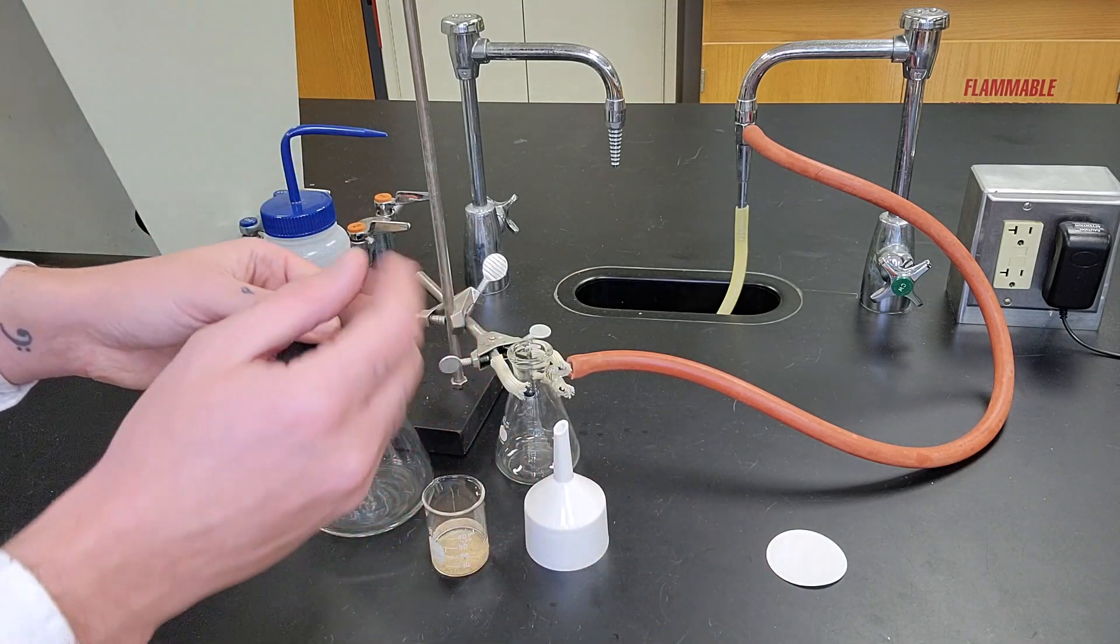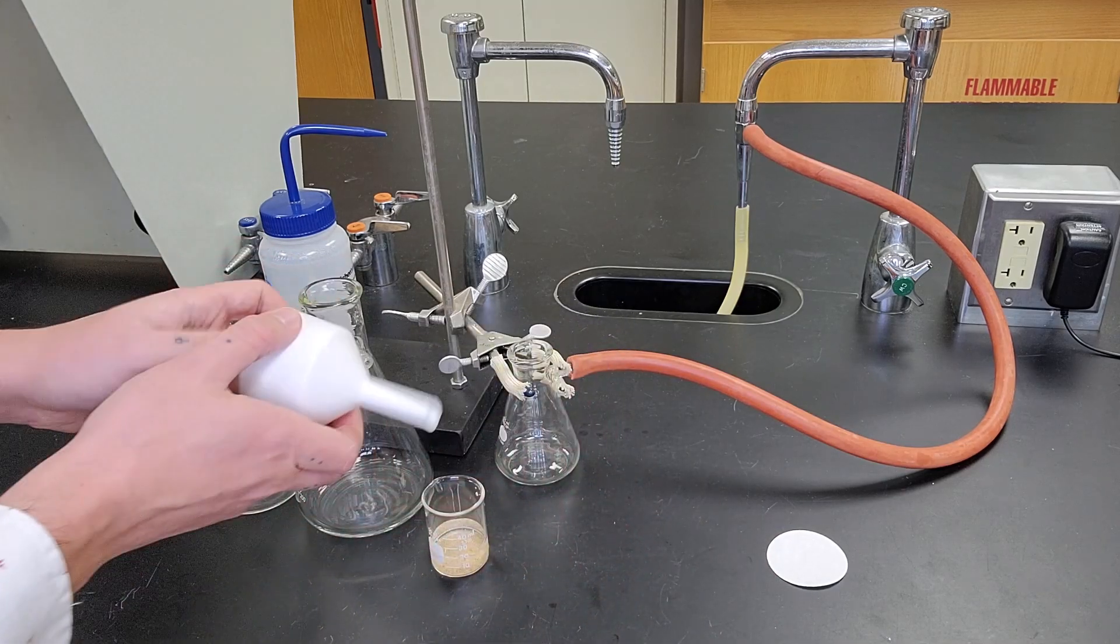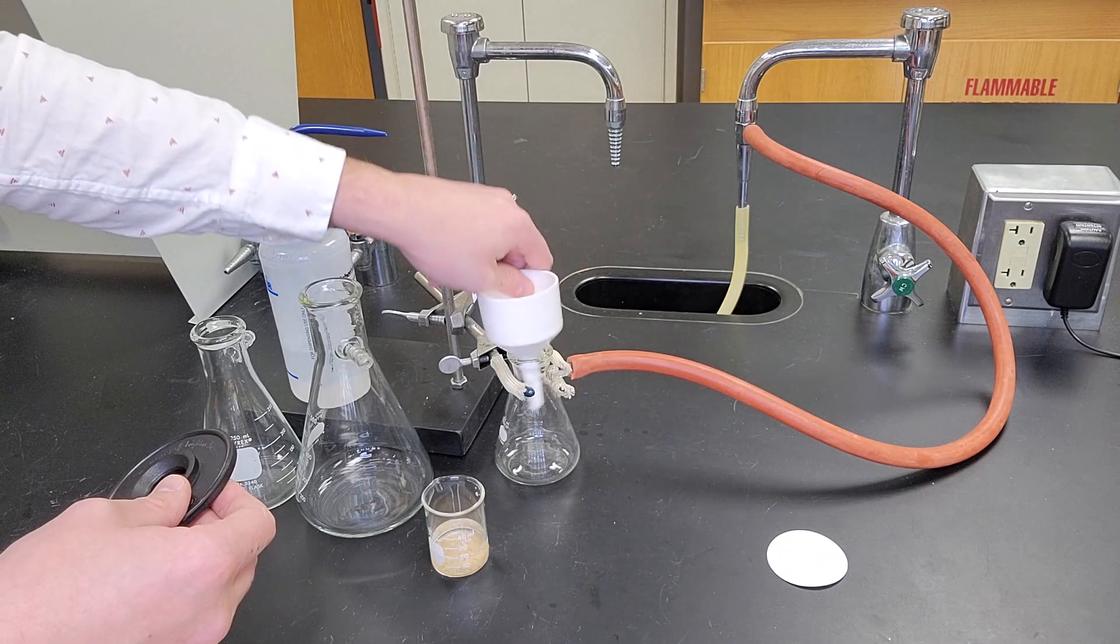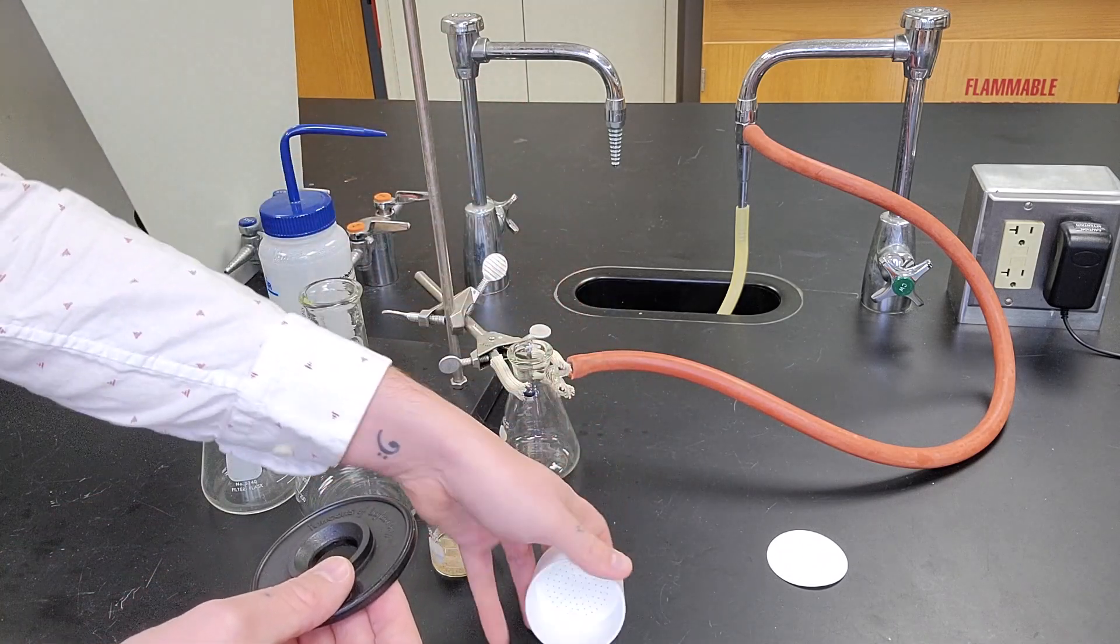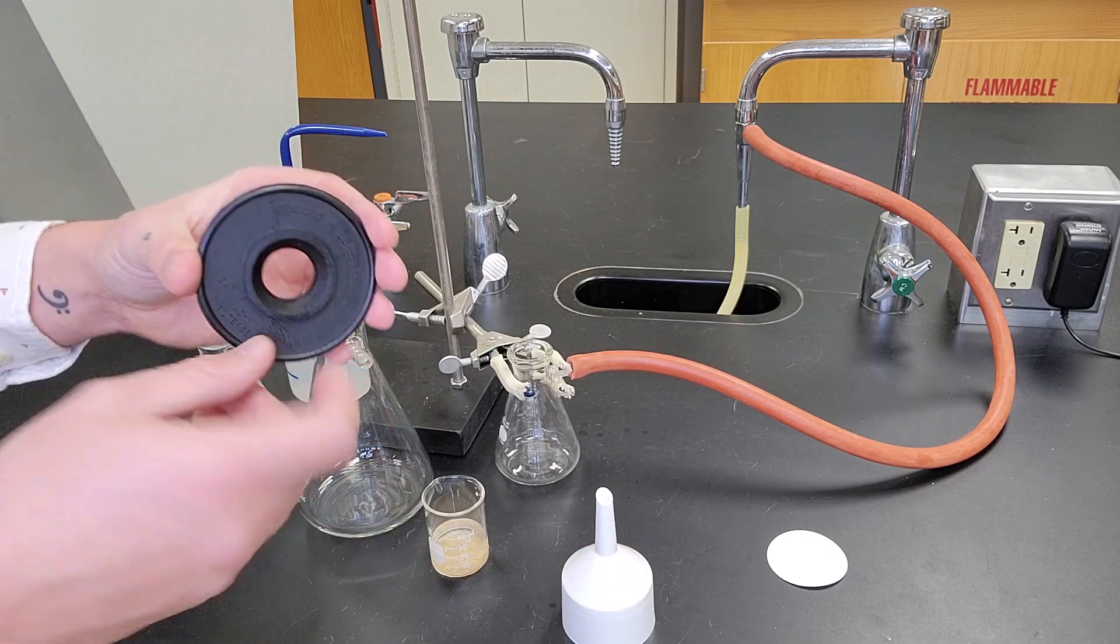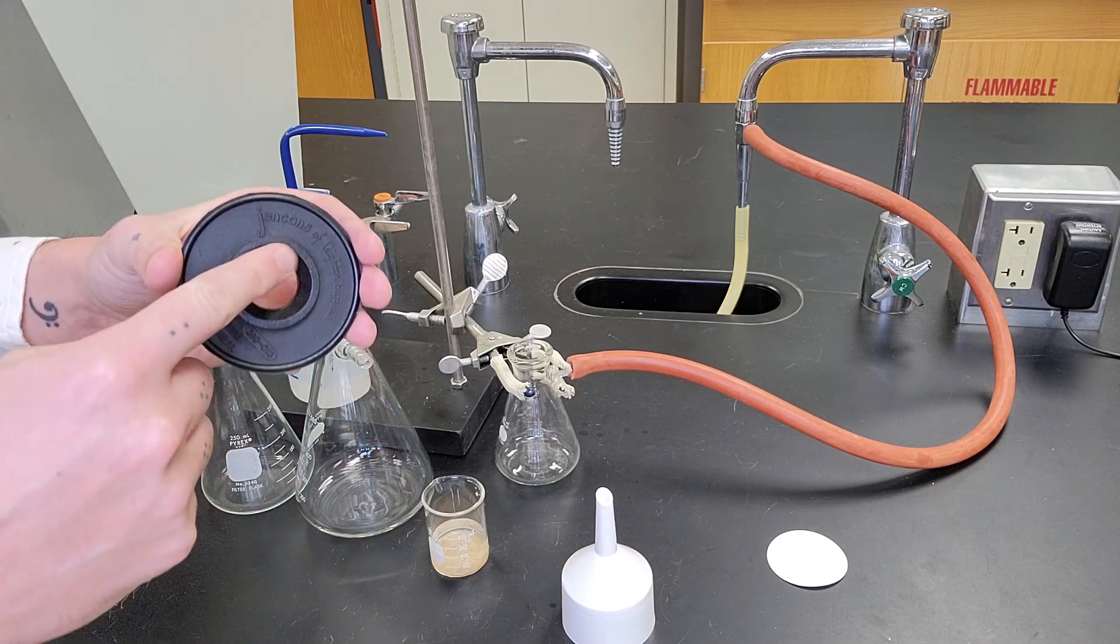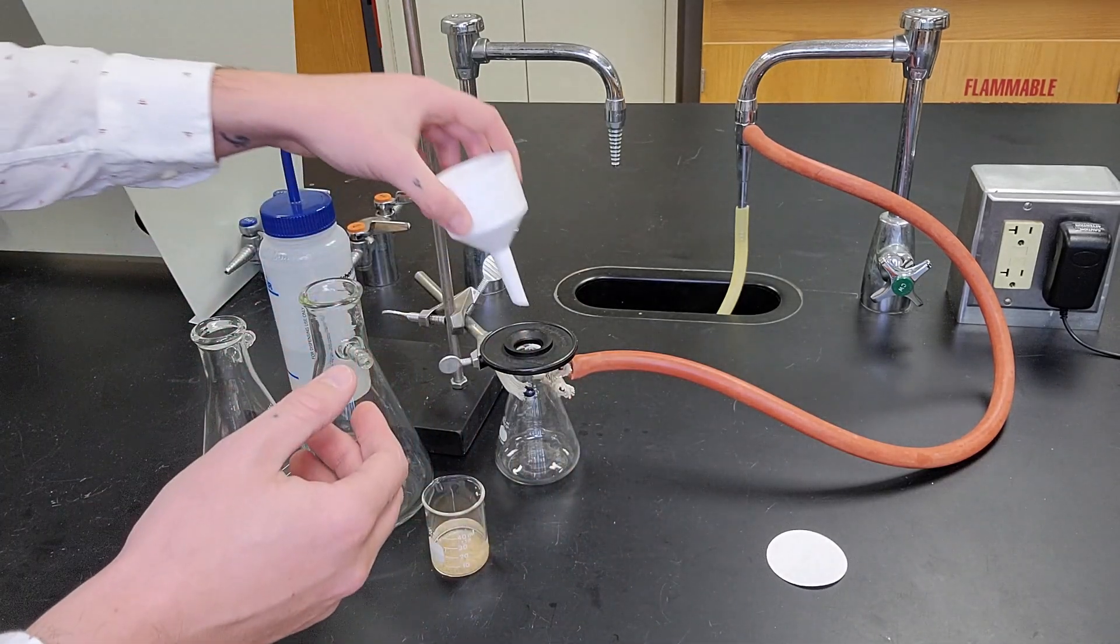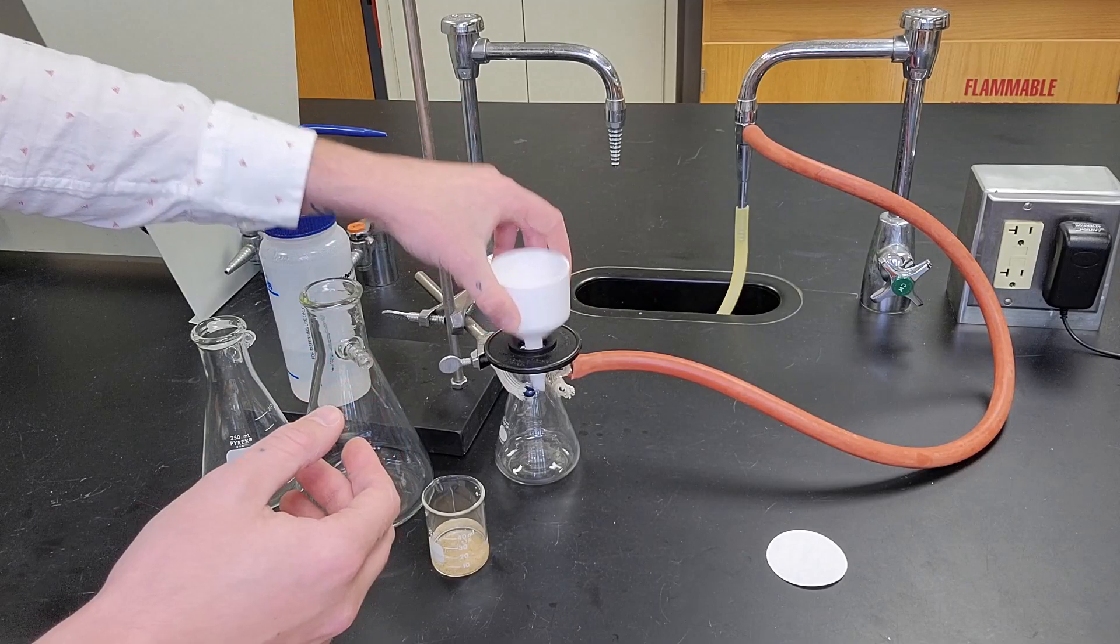Now between the Buchner funnel and the sidearm flask, this doesn't just sit on it like that. We have to actually create a seal since plastic on glass does not create a seal. So we have a rubber ring that is a little bit fluted and will sit in between the Buchner funnel and the sidearm flask.